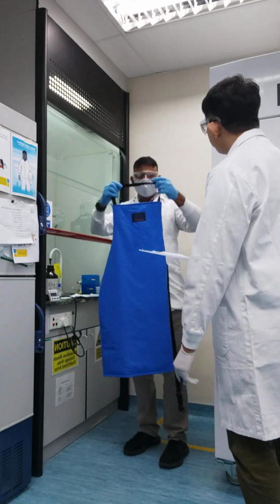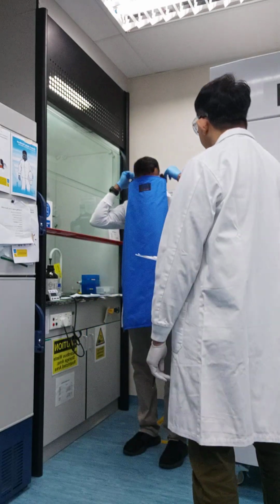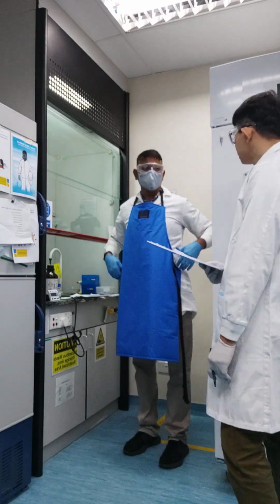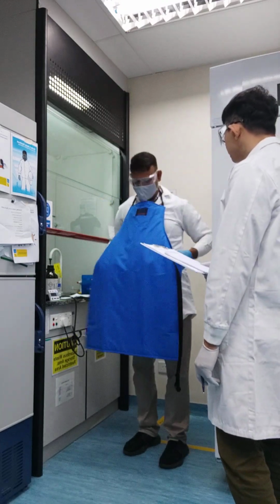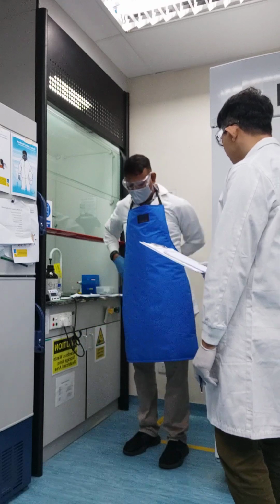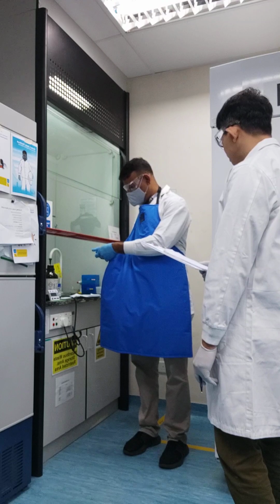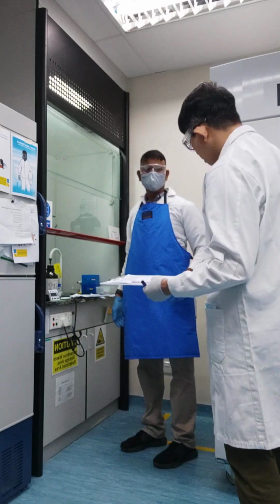So the first thing is, we need to wear an apron. This is to protect your body from accidental spills and splashes. So basically you wear the apron, secure it tightly.